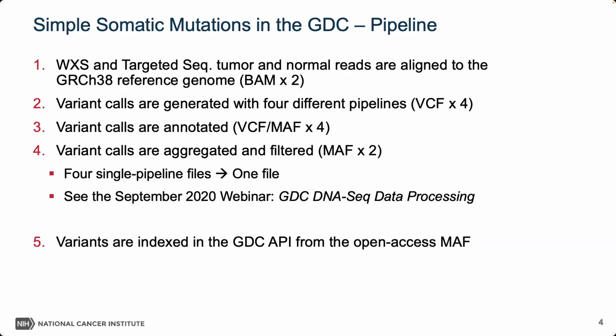Now, you might say, okay, why would you have a file with just a header in it? And the reason we do that is just so that users know we didn't forget to include the file. It's not missing. It's just everything was filtered out.